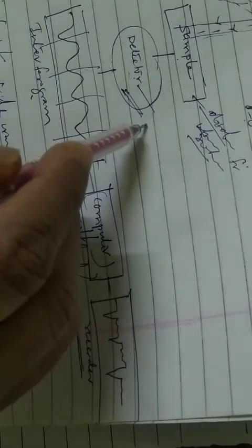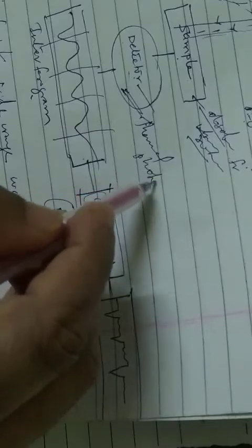And you see the splitter here. Two types are present, prism as well as gratings. Prism we can see simply in the IR, but gratings we can see in FTIR, where you can see the different mirrors, a series of parallel straight lines cut on plane surfaces. And even the detectors, photo detectors or sometimes thermal detectors, will be there.